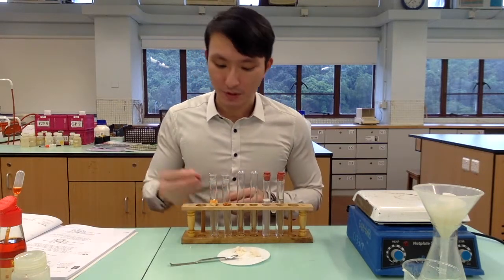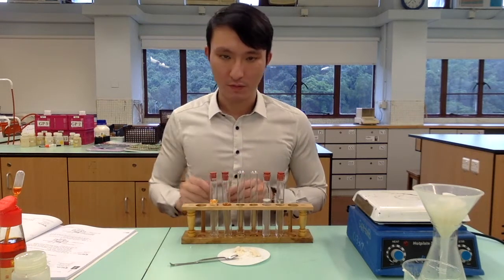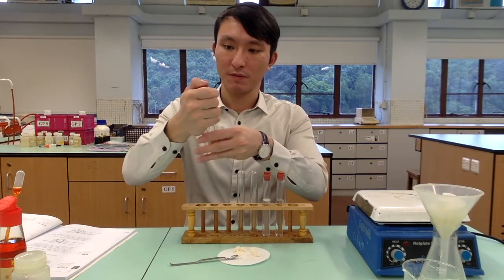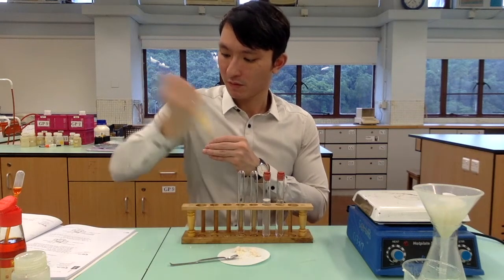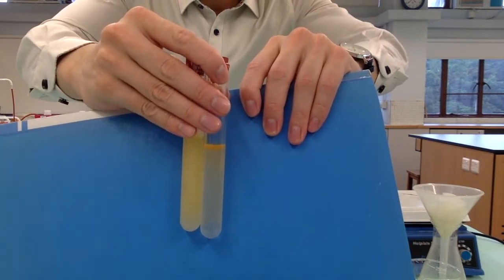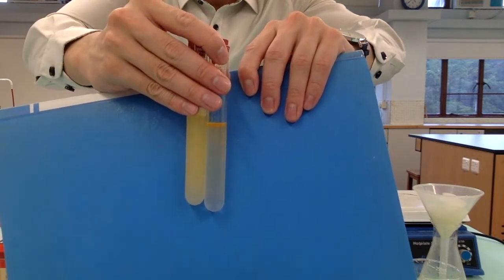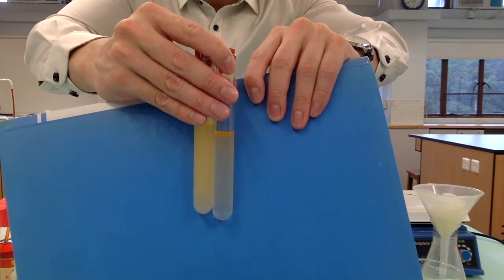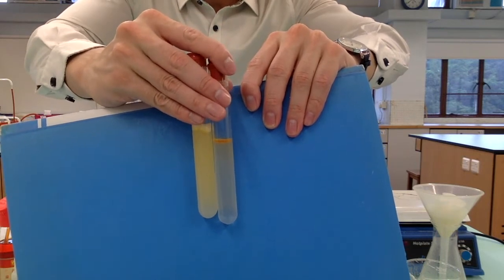Stopper the two test tubes. Now shake the two test tubes. Now, as you can see from my left, your right, that is the one with water and the chili oil. You can see the water and the chili oil are separated into two immiscible layers of liquid. Now, on my right hand side, your left hand side, that is the one with the soap added into it.